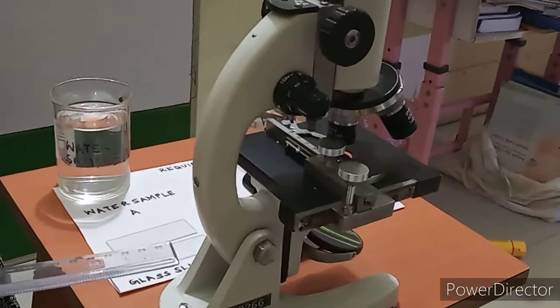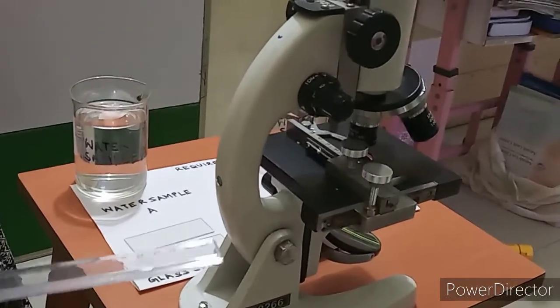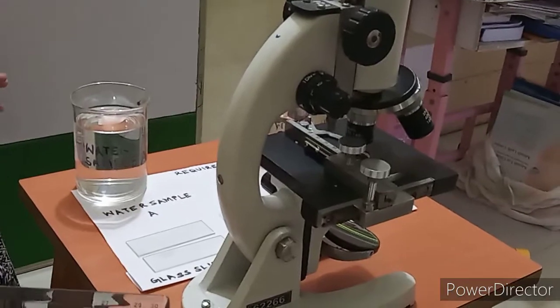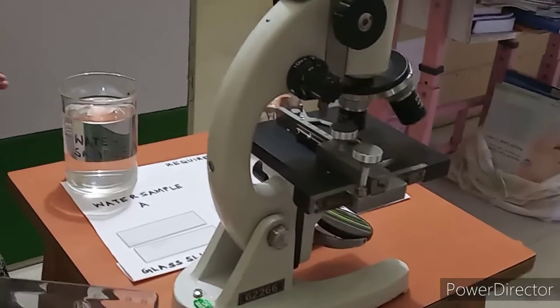Methylene blue and the spirit lamp are optional, children. If you want to fix the slide, we can use the methylene blue and the spirit lamp. But if you don't want to fix the slide, then we don't require the methylene blue and the spirit lamp.